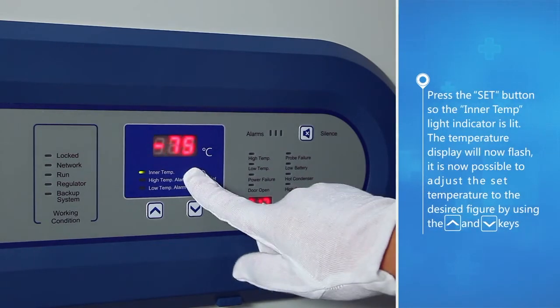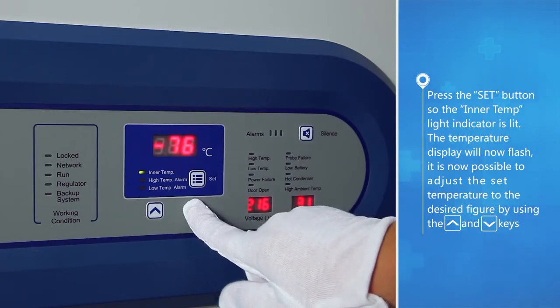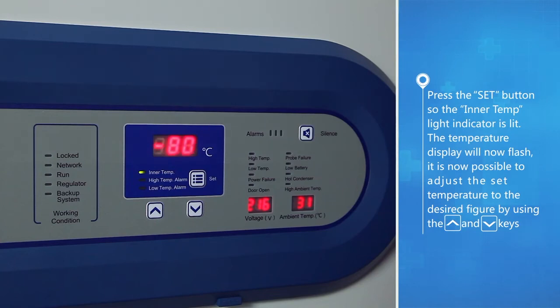Press the set button so the inner temp light indicator is lit. The temperature display will now flash. It is now possible to adjust the set temperature to the desired figure by using the up button and down button keys.